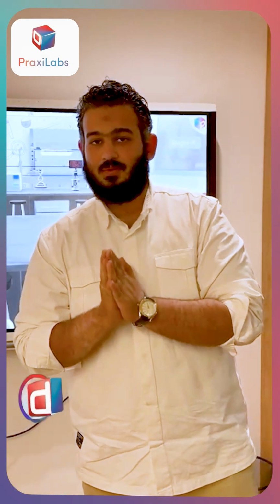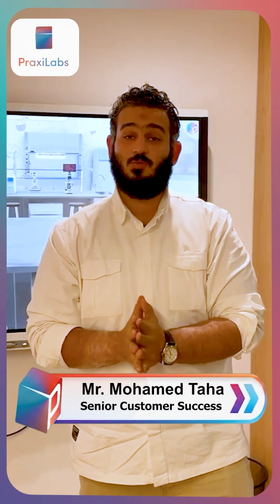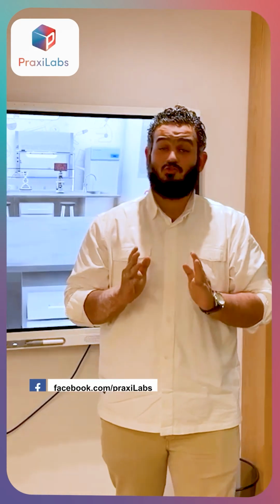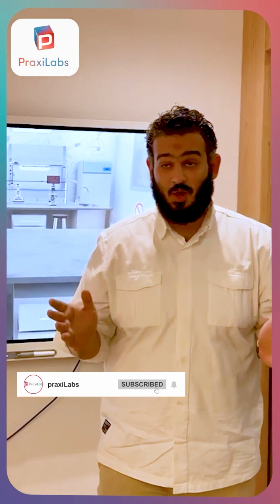Hello everyone, this is Mohamed Taha, a Senior Customer Success at PraxiLabs. And today I'm going to take you on a tour of our platform to show you how to get the most out of PraxiLabs. Today I'm introducing one of the most common and one of the most expensive experiments as well, the real-time PCR.